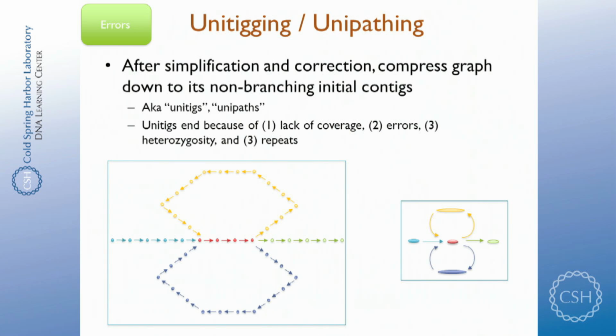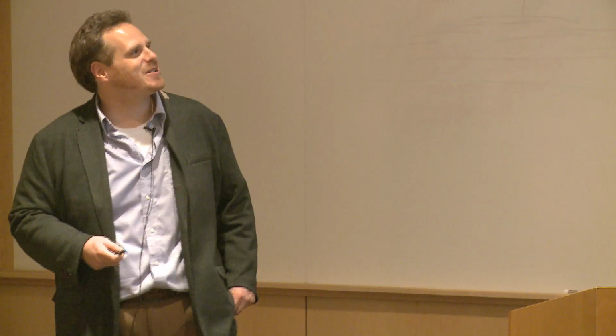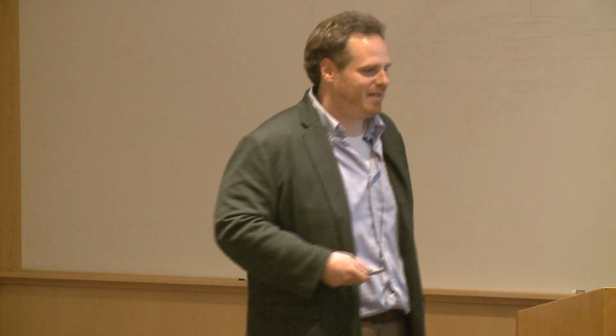Okay, so we can do all the sequencing. From that, you can do some estimates over genome size. You can work backwards and be like, oh, I need 1 lane, 2 lanes, 3 lanes. From that, we can load it into the assembler. In 5 minutes, I'll tell you a little about those assemblers that are available. Inside the assemblers, it'll create one of these big assembly graphs. It'll try to simplify that. Again, there's 3 or 4 different ways that you can possibly come to have branches or gaps along the way in the assembler.